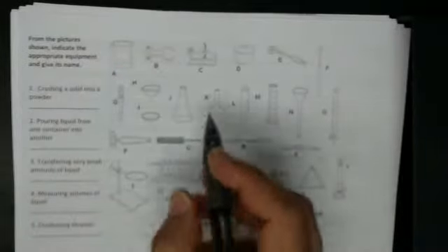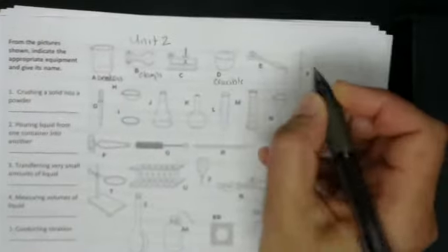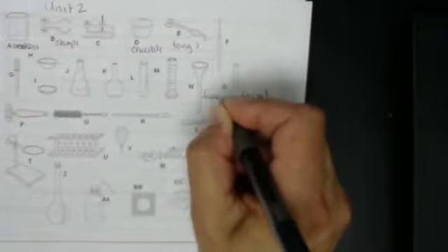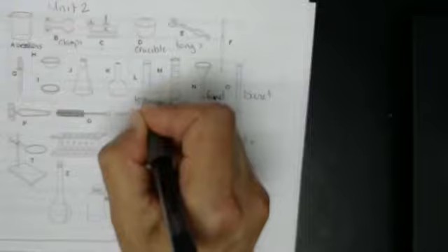So continuing on with Unit 2, at one point we covered all sorts of different types of equipment. Some of them we've used a lot more than others, like beakers, which I just spelt wrong, clamps, another type of clamp. We have a little crucible here, some tongs. Here would be a burette, a funnel, oops, spelled with two N's, a graduated cylinder, a test tube.